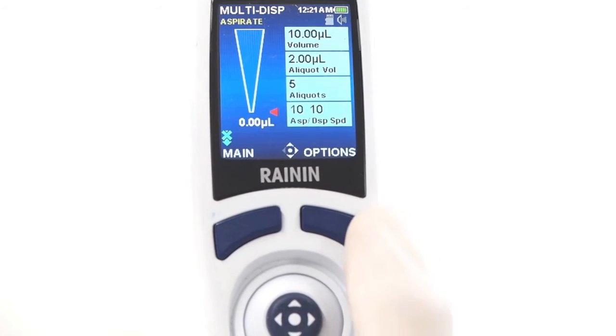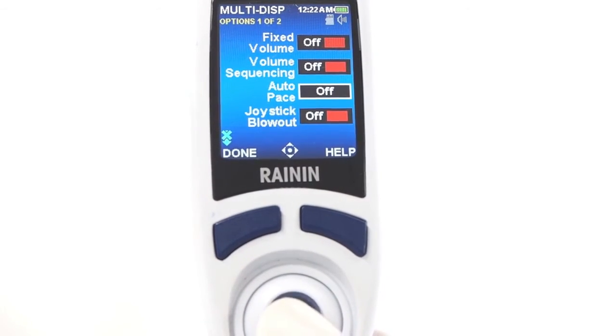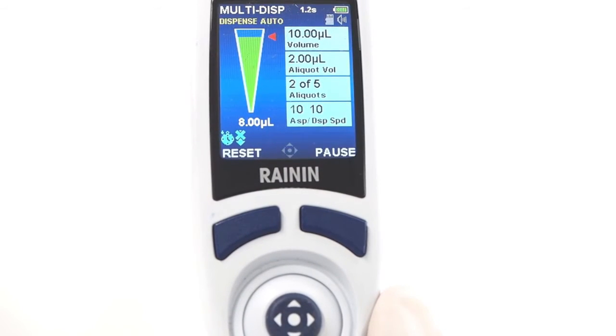You can also multi-dispense automatically at a timed interval that you select. Press options, joystick to auto-pace, and press the joystick to select it. Move right or left, up and down to adjust the auto-pace time interval, and press done to set. Each aliquot is now dispensed automatically after the time interval elapses. Note the timer counting down the time shown at the top of the screen.